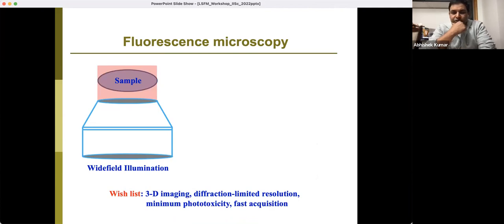So just to refresh your undergrad optics and microscopy a little bit, and I'm sure Professor Mandal covered that yesterday. Typically when we do imaging, specifically fluorescence imaging, we illuminate our sample with an LED or a laser light, and we excite some of these chromophores, whether it's a fluorescent protein or dye, and we look at the emitted photons at a red-shifted wavelength.